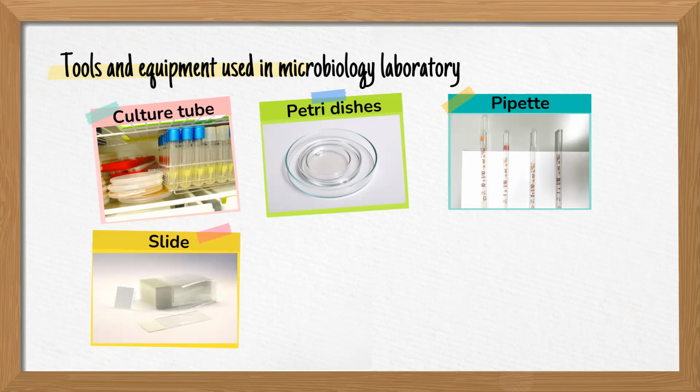Bacteriological slides. The size of the slides is about 2.5 to 7.5 centimeters. They are used as a support for microscopic specimens. There is also a slide with a concave slide to observe the motility of the microorganisms.